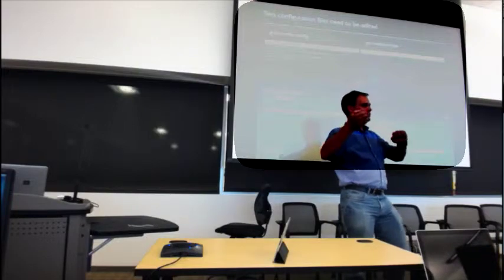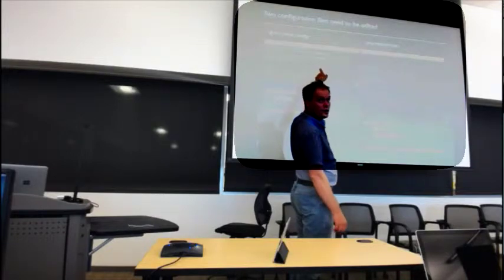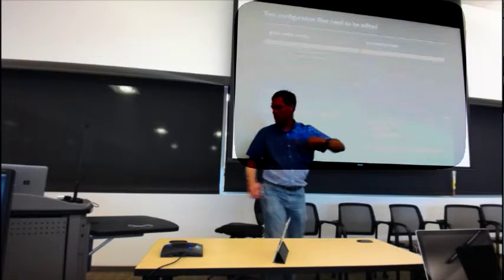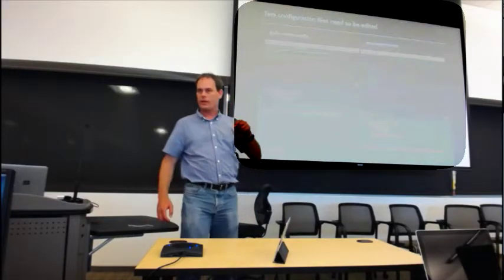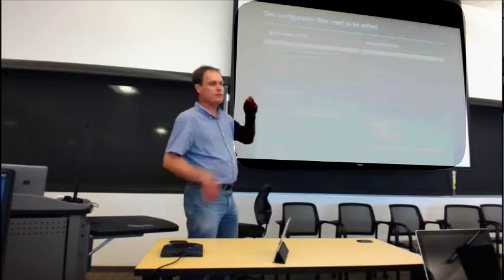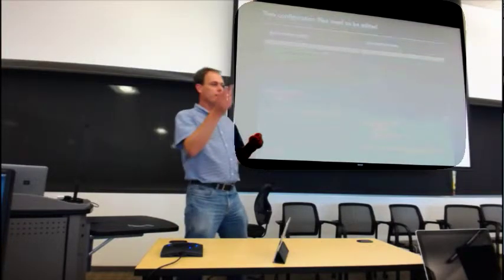So maybe someone wants to look. Don't use this directory name, of course. It's Nadia's. Yeah, it's the one from this experiment. It's not that one. I put the wrong thing up. But if you use the tarball that you listed, it comes with the right numbers. Yeah, right. But there was a problem here. Couldn't create something in Scratch. Now you can't create things in the experiment directory, the CXI whatnot directory, because that's admin only. But in Scratch, you should be able to mess around.